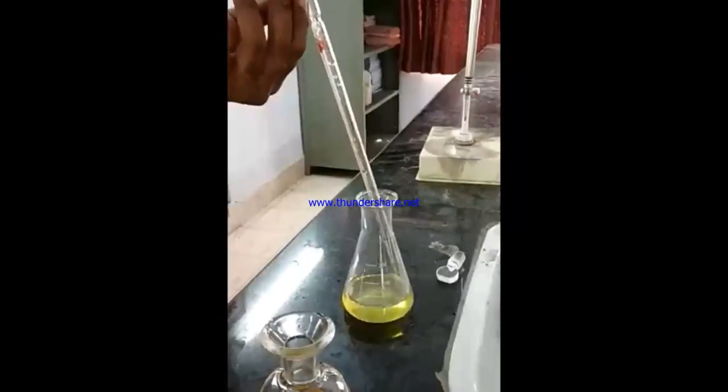Anyhow, that will also work. Now we will add starch as indicator, and it will turn, suppose, bluish green in color.